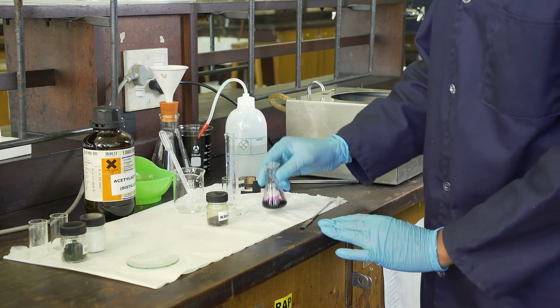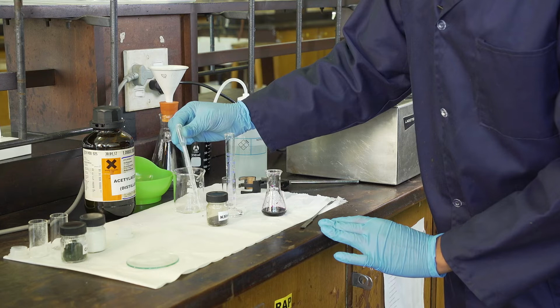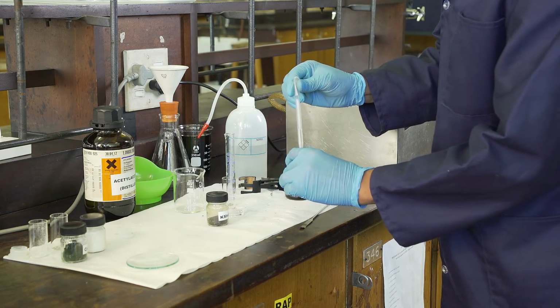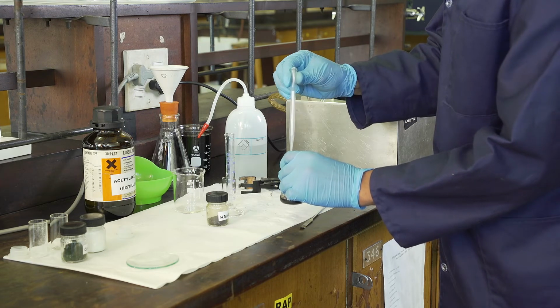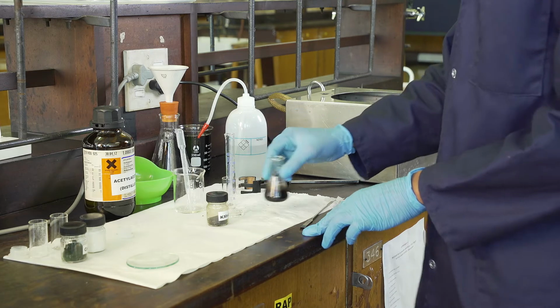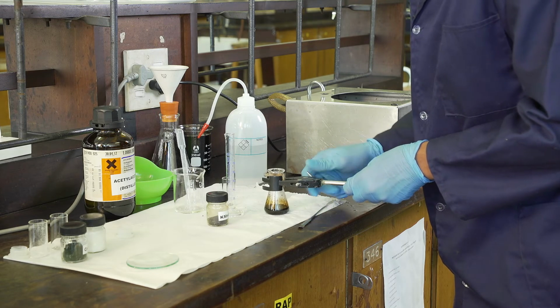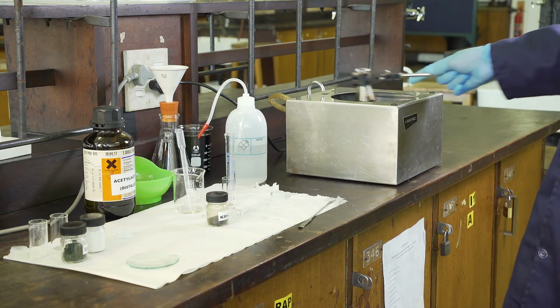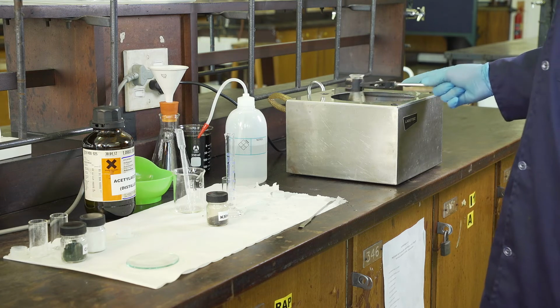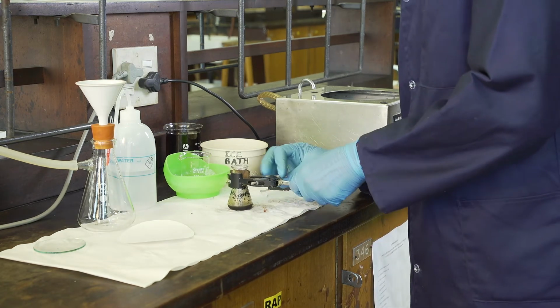Once dissolution has been achieved, we then use a plastic dropper to transfer approximately 2 ml of acetylacetone. This will be followed by gentle swirling. Then we use a clamp to hold our conical flask in position. Then we swirl it over a steam bath for 15 minutes and observe as our brown colored crystals begin to form.